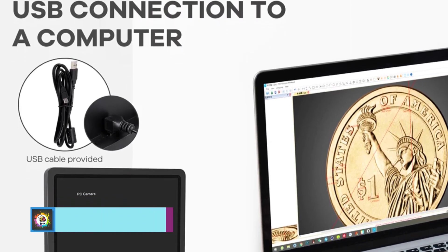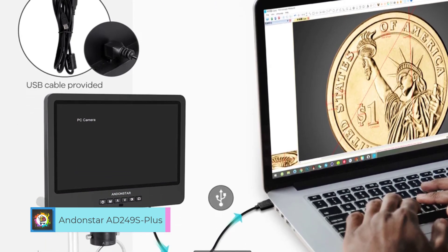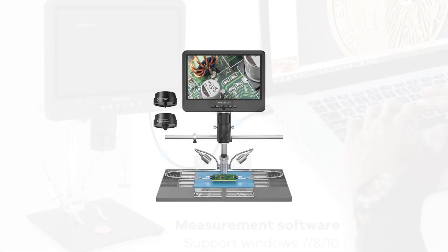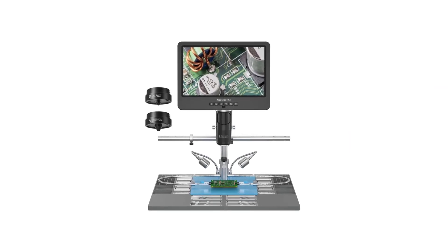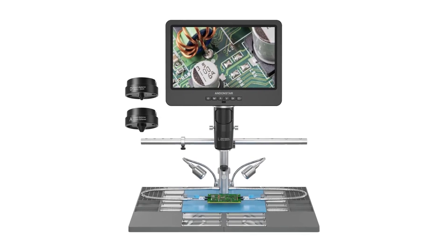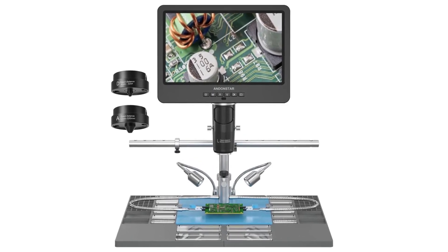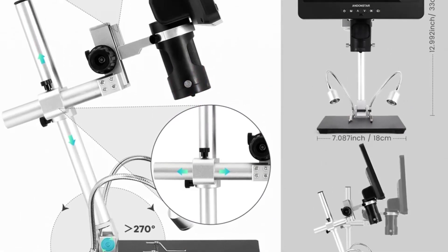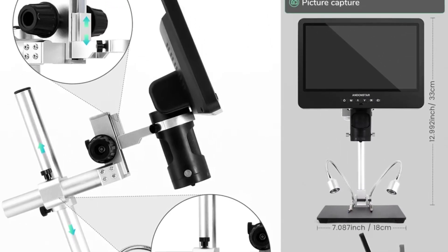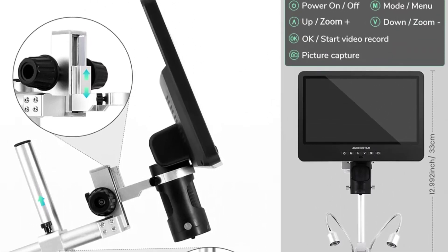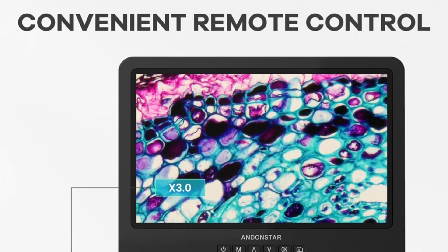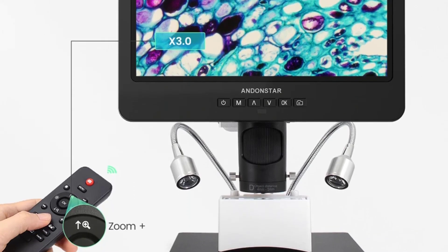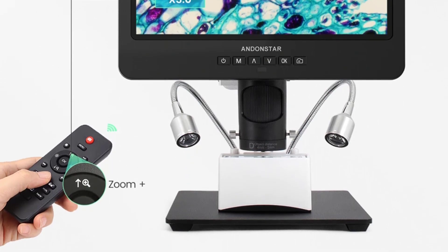Number 4. The Andenstar AD-249 Plus LCD Digital Microscope is an impressive piece of technology that brings the microscopic world to life with stunning clarity and convenience. As a smart device, it seamlessly integrates modern features with traditional microscopy, making it a valuable tool for professionals and hobbyists alike. One of the standout features of the AD-249 Plus is its high-definition LCD display, which provides crisp, clear images of specimens, allowing users to observe even the tiniest details with ease. Whether you're examining cells, insects, or other small objects, the clarity and precision offered by this microscope are truly exceptional.